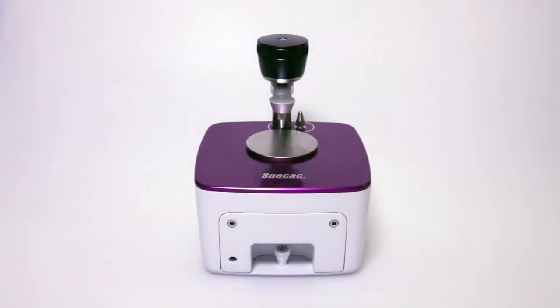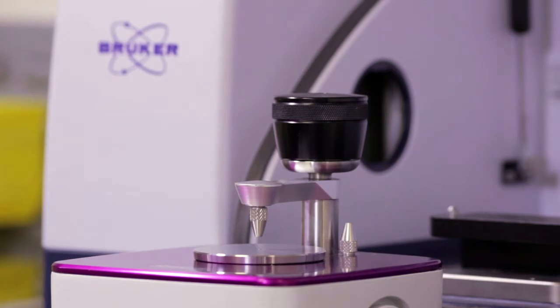The pressure tower provides a consistent and reproducible load to a pressure anvil to ensure excellent contact between the sample and the ATR crystal.